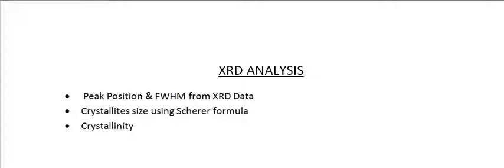To calculate the crystallite size, there are two ways. One is the most popular approach, and there is another approach which is quite simple. I am going to explain both the methods, and then in the last section we will see how to calculate the crystallinity, which is the peak to noise ratio. I have shared all the formulas also. So let's start.